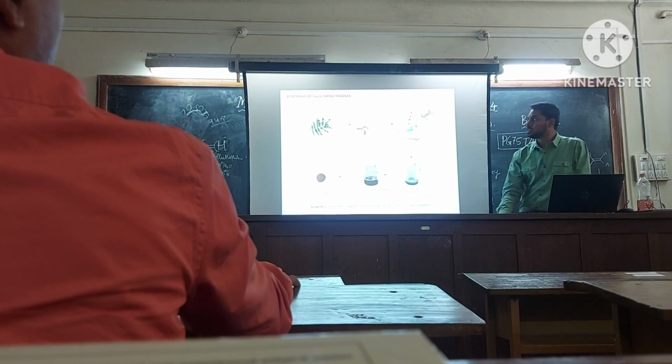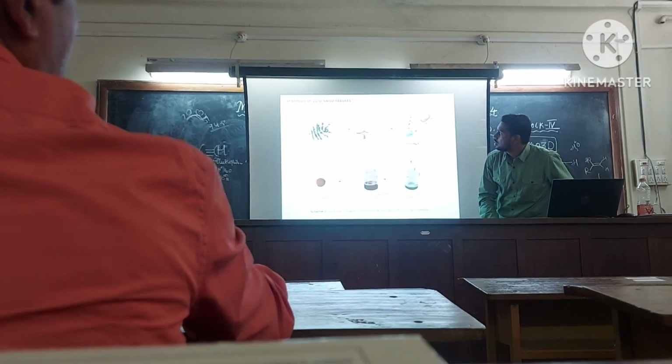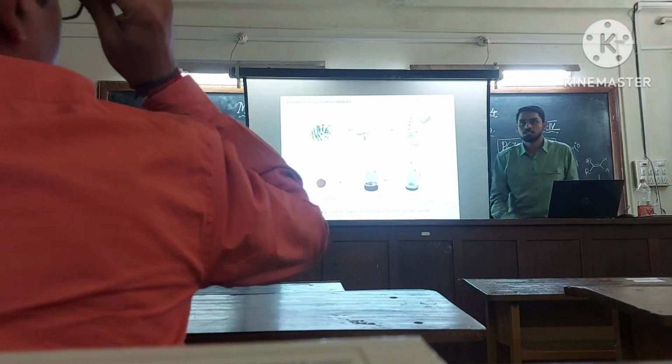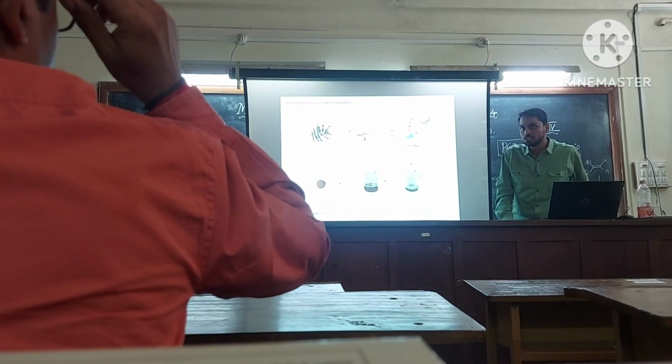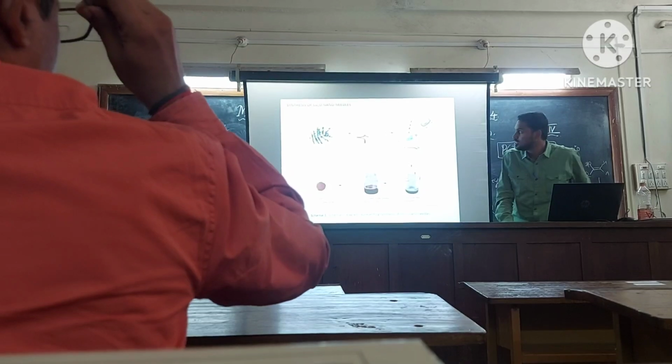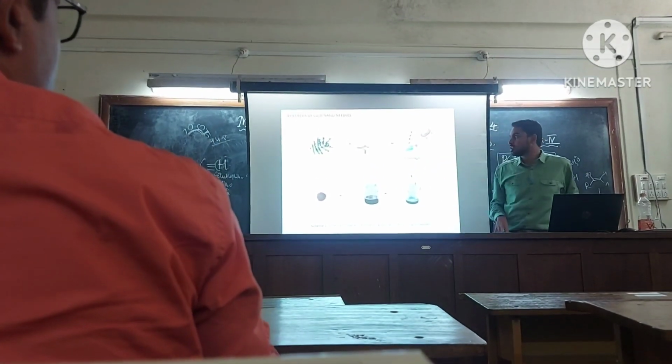The aqueous PP solution, that's like the solution in the second beaker. Sir, aqueous solution of PP. What color is it? Colorless? Slightly brownish.